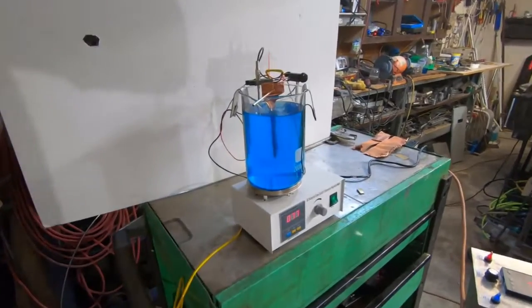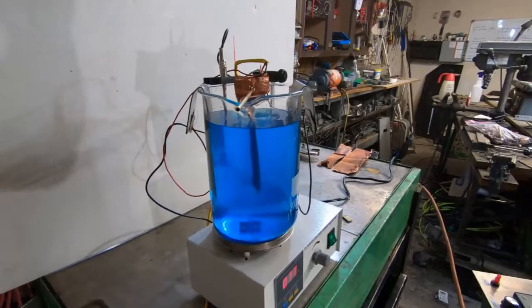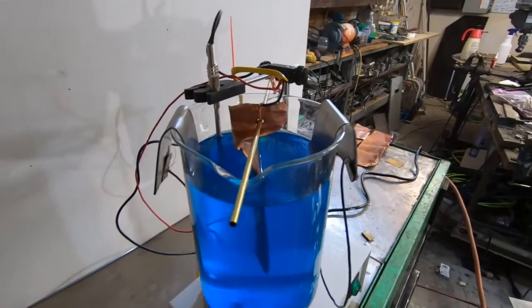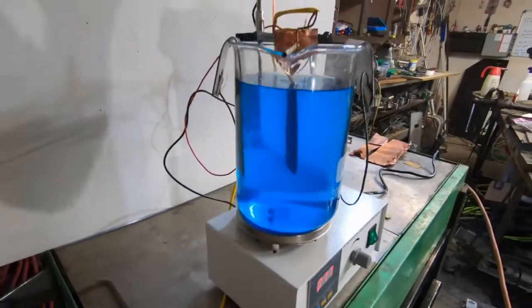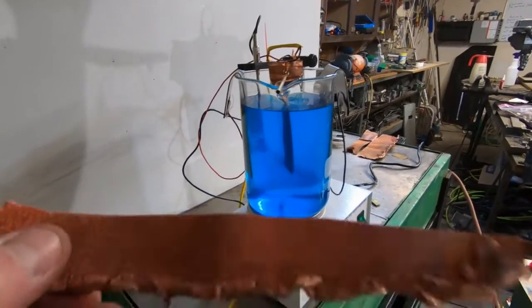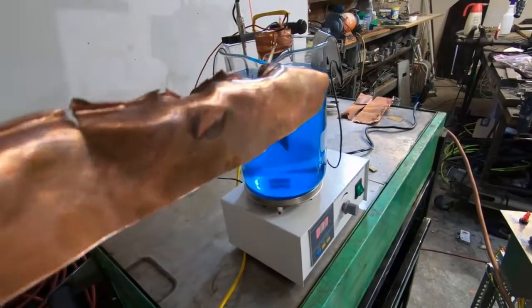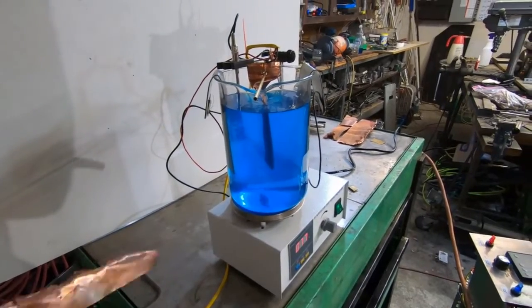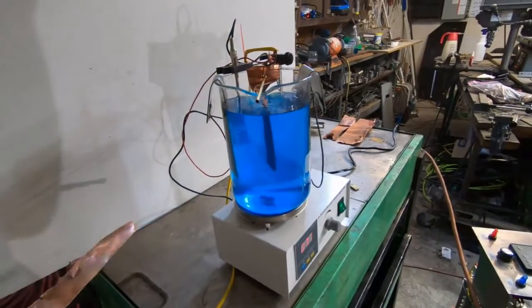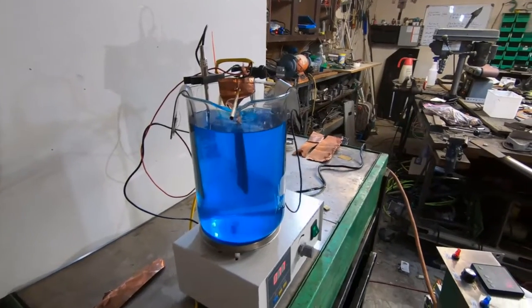What's going on, fellas? Doing a quick little experiment for Basil. We have a copper anode in place inside this electrolyte bath that came from our e-waste refining process. This is e-waste copper, and because the e-waste anodes, or doré bars, are so dirty, getting pure copper can't always be done in the first run.